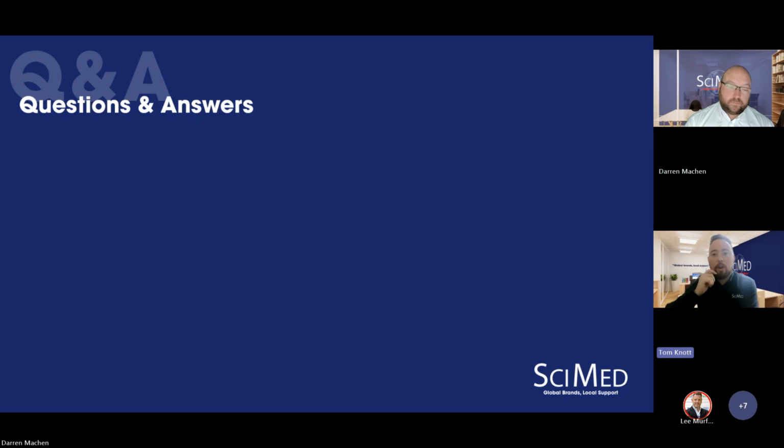That's great. From my side, automation is an interesting question actually, because it's not an off-the-shelf thing offered particularly by Rigaku, though there are now third-party customizations starting to become available for sample transition and loading, if that's the side of automation we're talking about in terms of throughput through the instrument. Where I would say something is automation is more in the sample interpretation.